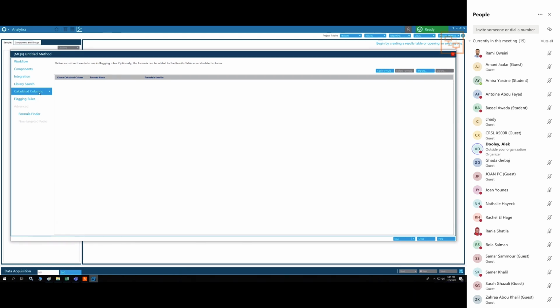You can also do things like summing and averaging and means. So it's kind of like a little Excel program written into your method. For us, it's a little bit too complex, I think, for just the beginning. So we'll skip it for now, but we can come back to this. Like I said, especially if you do quantitation, this is a very powerful tool.